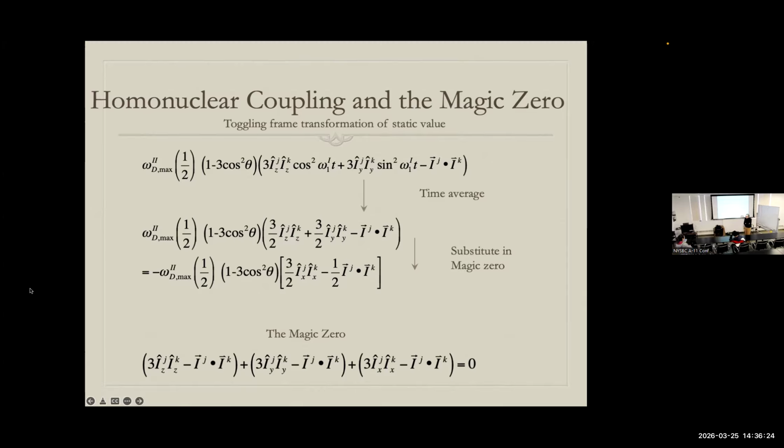What's the problem with slowing down? You said you could either be really fast in comparison, which would be like half a megahertz, or you could be really slow. Oh, in order to not reintroduce a coupling, you could be much slower than the coupling and do something clever with the spinning side.